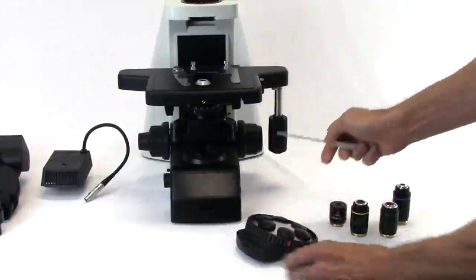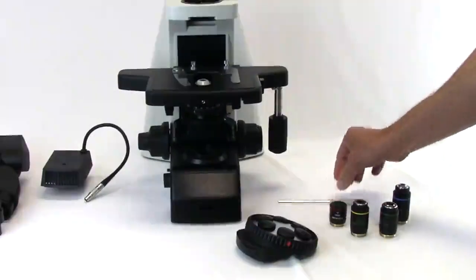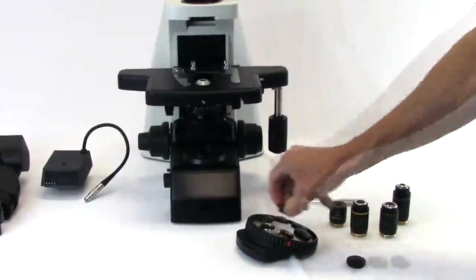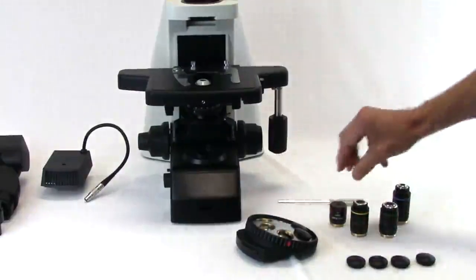Beginning with the dust plug at the position indicated by a red dot, work clockwise and unscrew enough dust plugs for the number of objectives you will be installing.